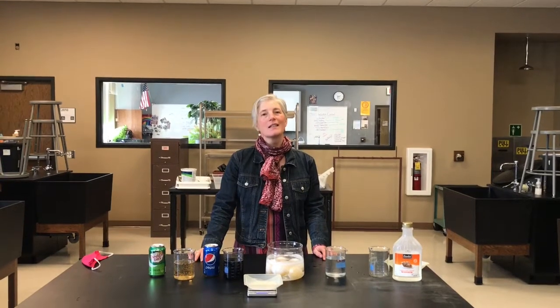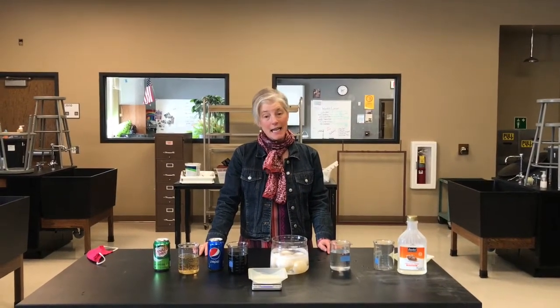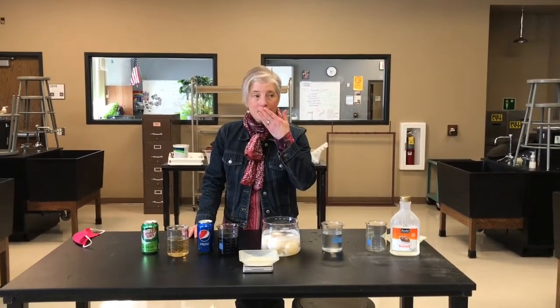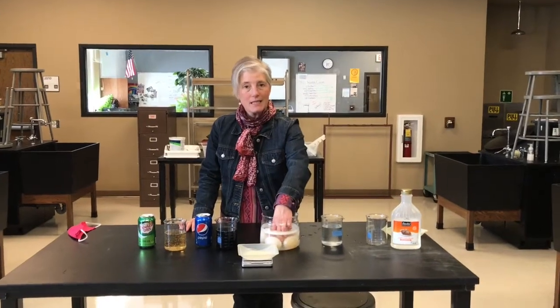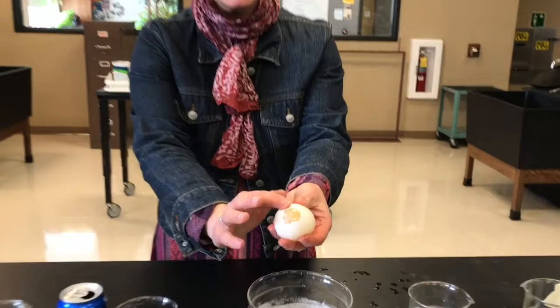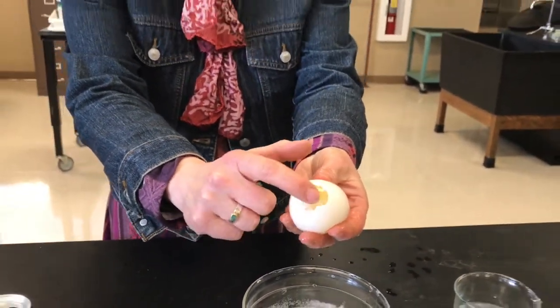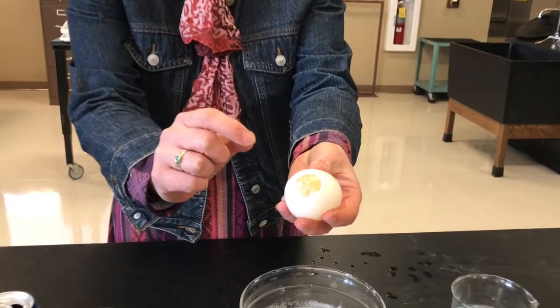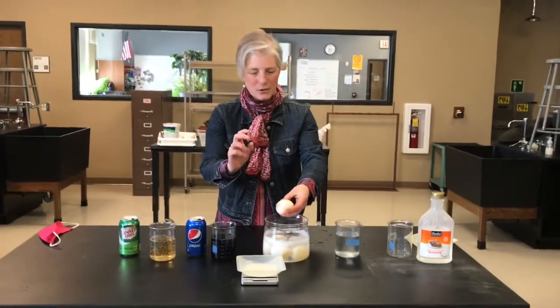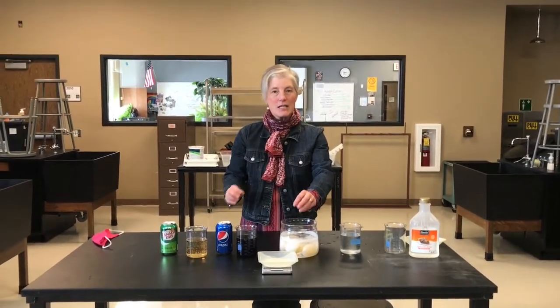We are doing the Egg Osmosis Lab. I would like to say the naked egg lab because we have put some eggs into vinegar. It smells like pickles. When you put an egg into vinegar, it starts to dissolve all of the shell off of the egg, and all you're left with is that little peely stuff that's underneath the shell. Sometimes if you've ever opened a hard-boiled egg or cracked an egg, you've felt that little thin, almost like skin underneath the shell.